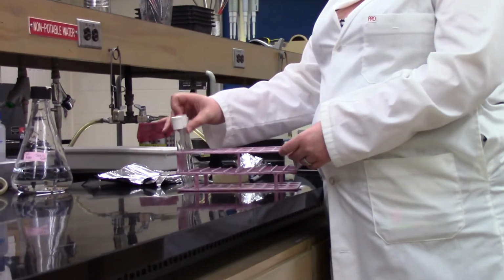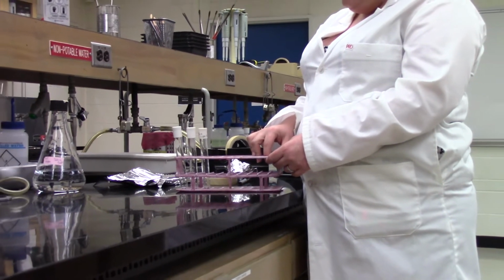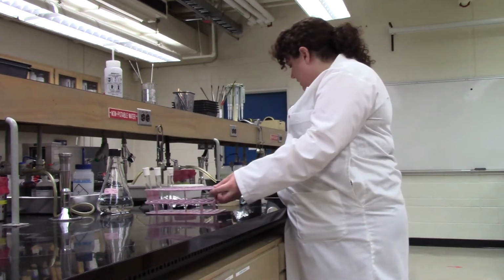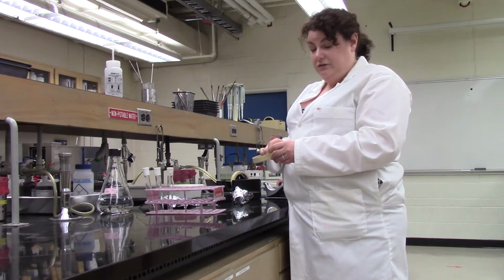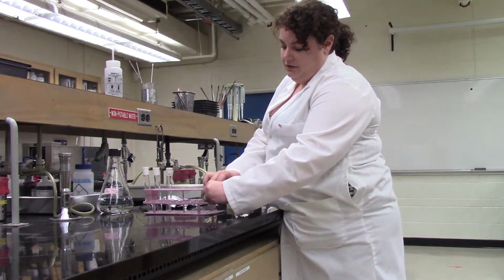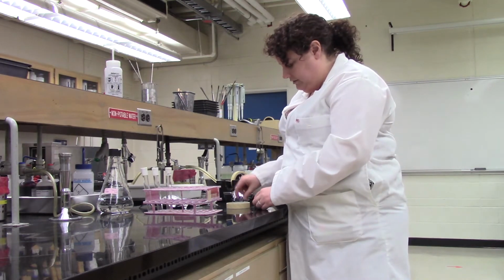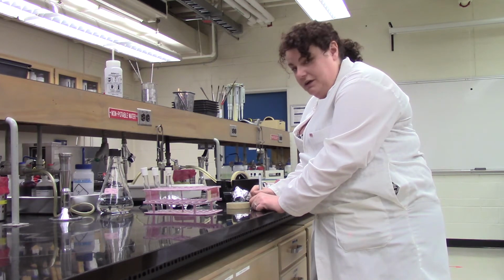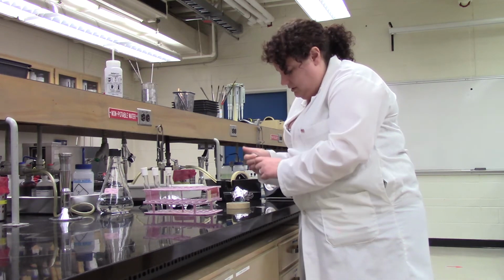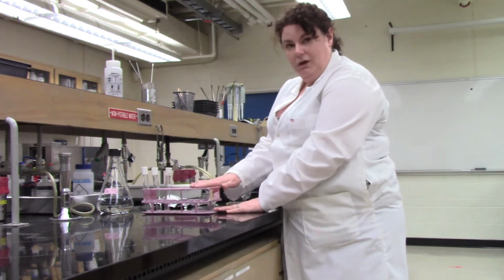And you can fill your test tube rack with as many or as few tubes as you need. If you're only autoclaving 3 tubes, it's kind of nice to space them out just a little bit so that the steam can access each of those tubes easier. And for these, you don't necessarily have to label every single tube, especially if they all have the same thing in them. And you definitely don't need to put indicator tape on every single one. Instead, you can just do a single piece of indicator tape. We can put that right on the end of the test tube rack, and then just give yourself a quick label for the rack itself, assuming that multiple people are putting things in the autoclave. There we go. So now that I've got a label on here, this as well would be ready to go into the autoclave.